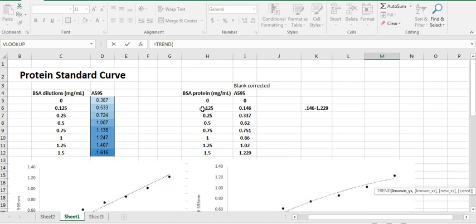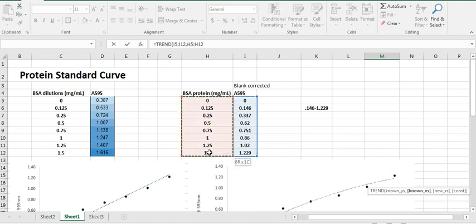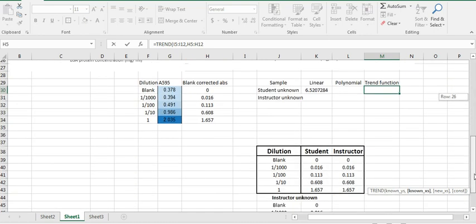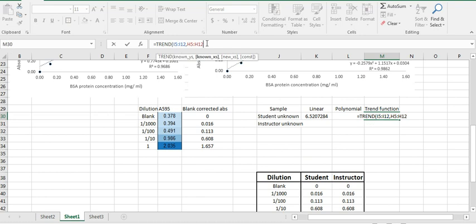So you are going to give it the Y values, which are over here, the blank corrected absorbances. Then it's going to ask you for your X, and your X value is over here, which is the protein concentration. And then it's going to ask for the actual absorbance that you're trying to calculate the X for.